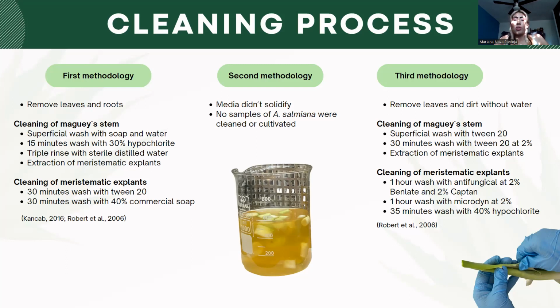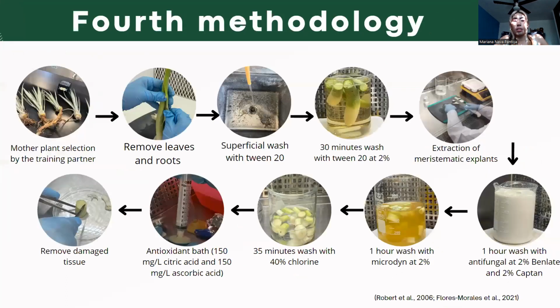So for the third methodology, we decided to add a bath with antifungicals, Benlate and Captan, as well as a bath with Microdyn to combat the contamination of fungi and bacteria. And also, we decided to add for the fourth and final methodology an antioxidant bath.